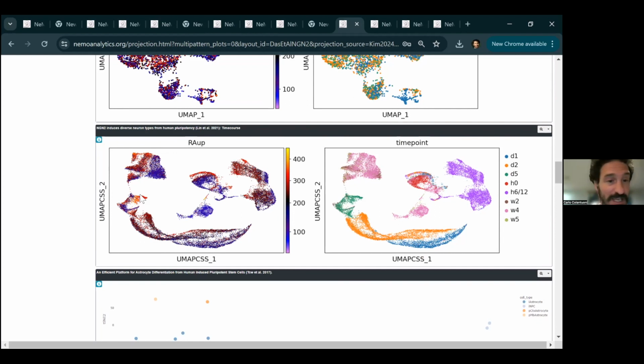And here you can see at this day 5 time point, there is an entire packet of cells that have particularly high retinoic acid. And if you remember, this was the EMX high, and all of these were the PRPH high. So then there's even a subset of PRPH neurons for some reason. I don't know if it's difference in fate or difference in differentiation level going further down the road, but there's a set of those PRPH neurons that are higher in retinoic acid response gene expression.